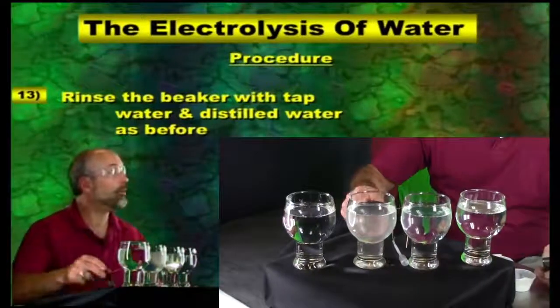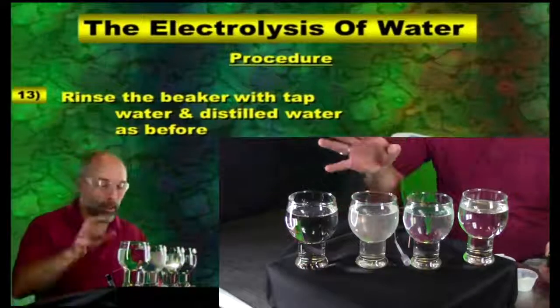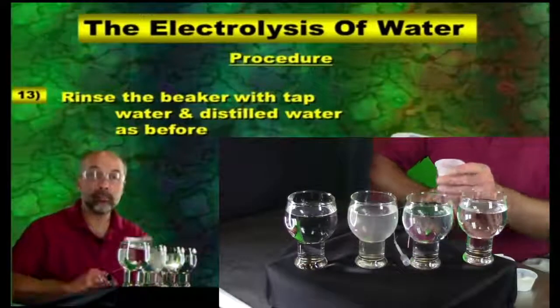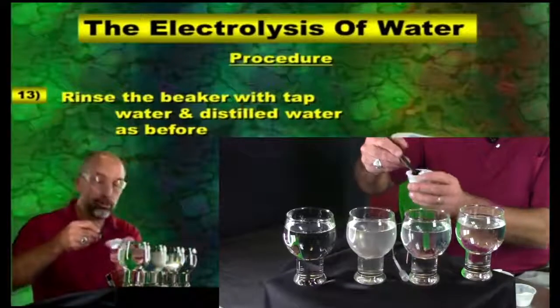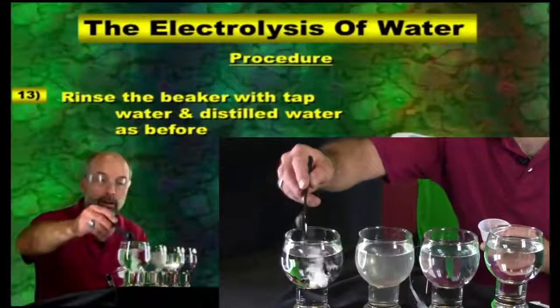We're going to do one more. I'm just going to throw this one in. It's actually not in your lab at all. But what we want to do is take one more substance. I decided to try something known as just detergent, the kind that you wash your clothes with. And we're going to put that in here.